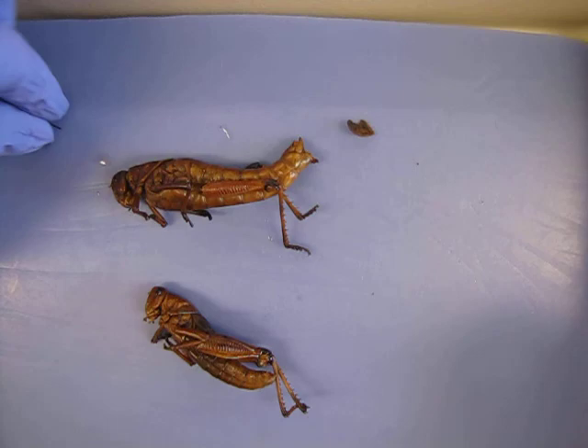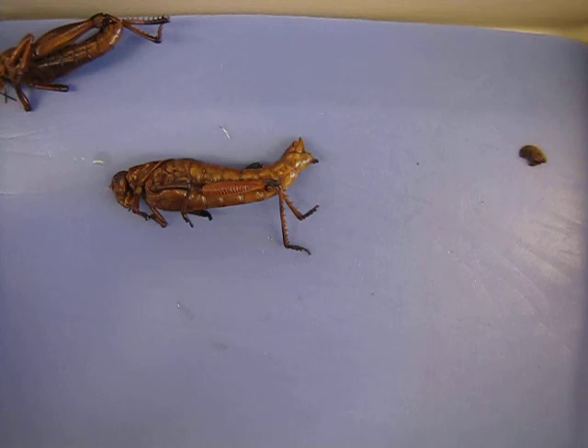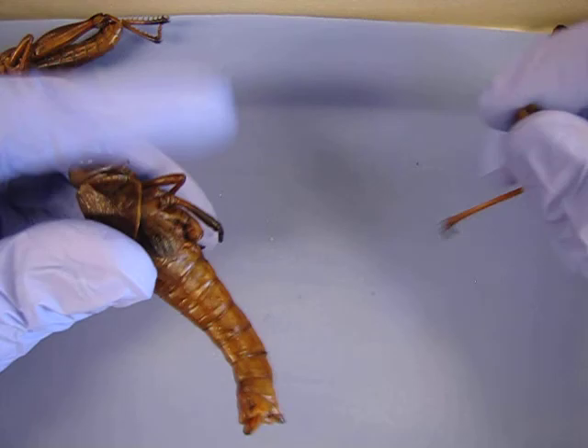Okay, internal grasshopper dissection and anatomy. Whether you have male or female, the dissection will proceed relatively similarly, but make sure you can also identify structures on both. This is especially true of the female because when you open her up, usually you'll see a great number of eggs, and you'll need to be able to identify that for your practical.